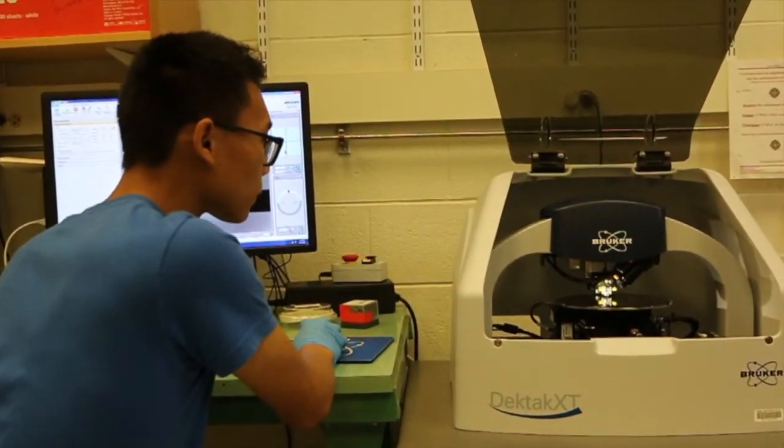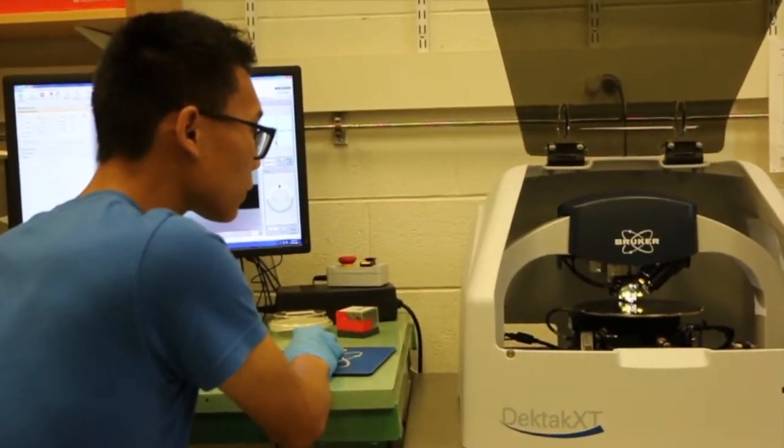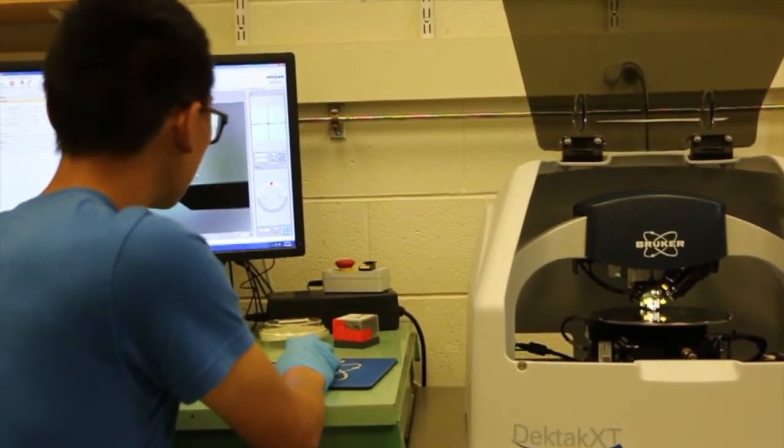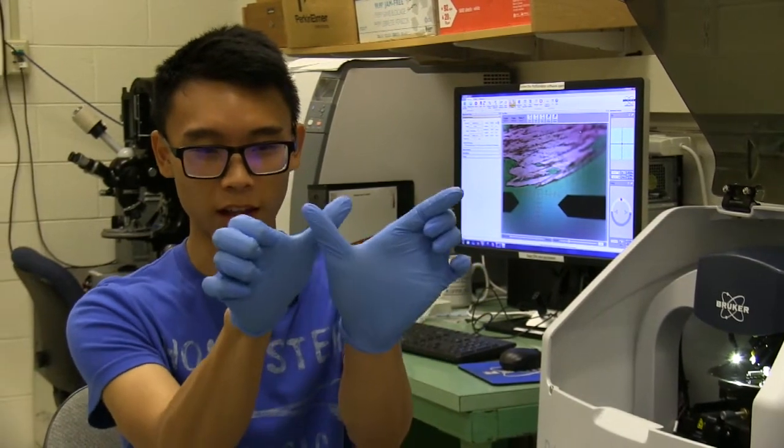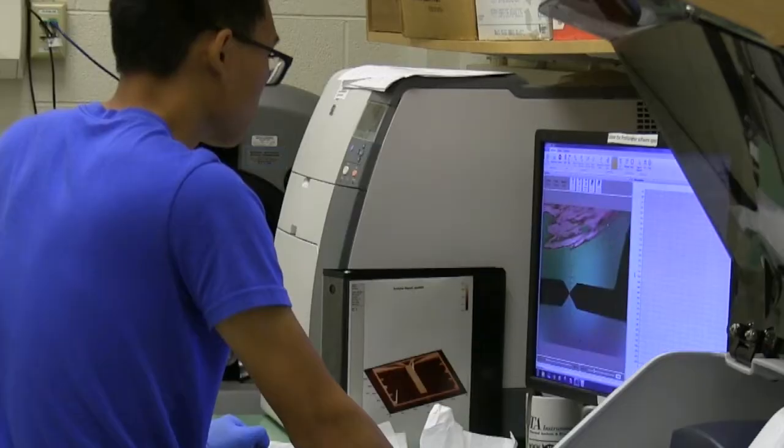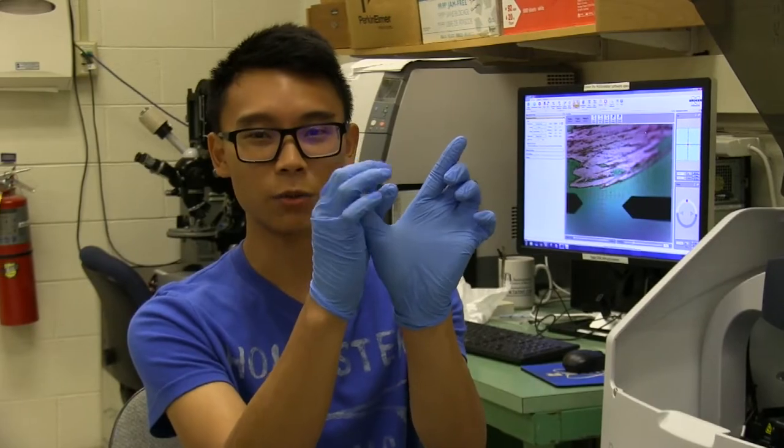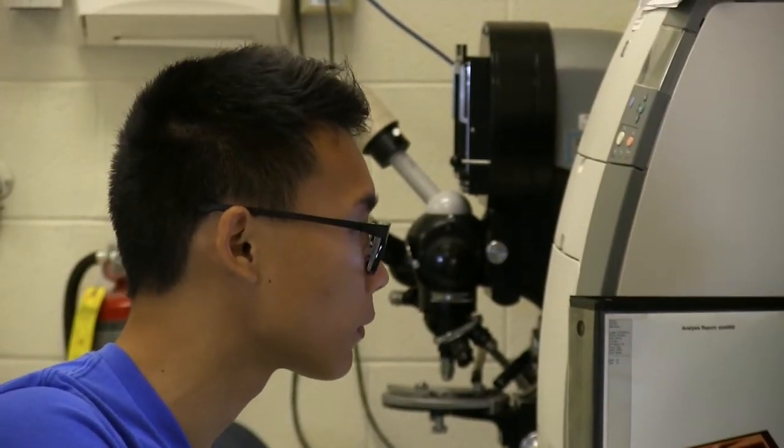We call it a line-of-sight model, which is basically when it evaporates it'll go out sort of outwards this way. We want to create some sort of overlap between them in this region here. We want that region to be of uniform thickness.